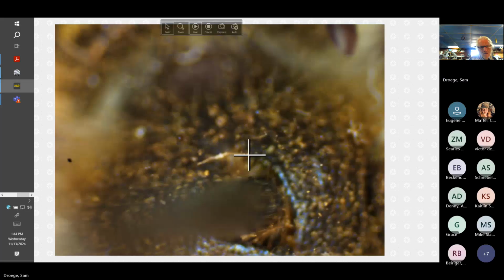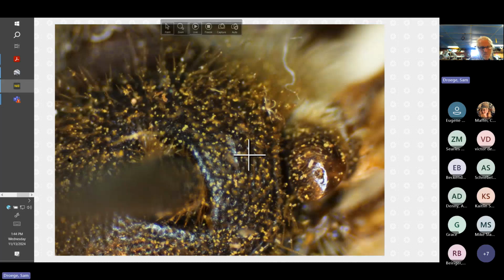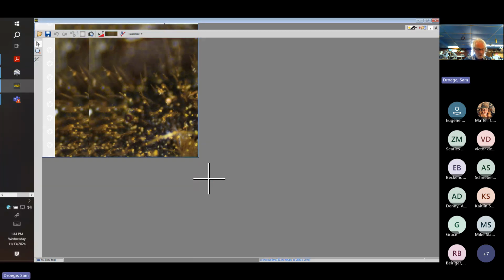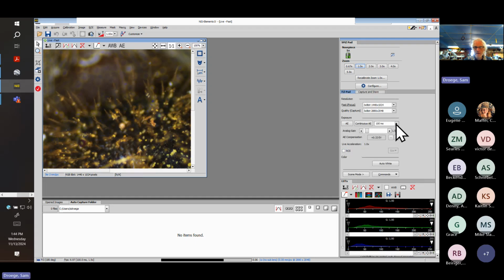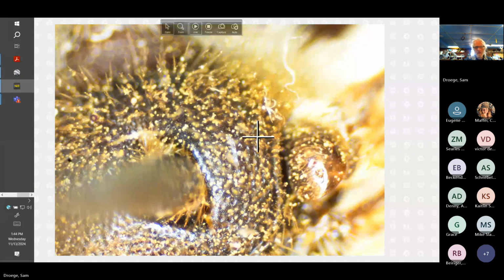Jump up here. Well, the fact that we're having a hard time seeing this probably means that they are touching one another and making it so we don't have the shiny interstitial spaces. There's a little bit there, but that's probably the parapsidal line. So I'm going to, this seems like something to see. We'll change the lighting. So go there and bump it up 300. Nice. Make this big. All right.